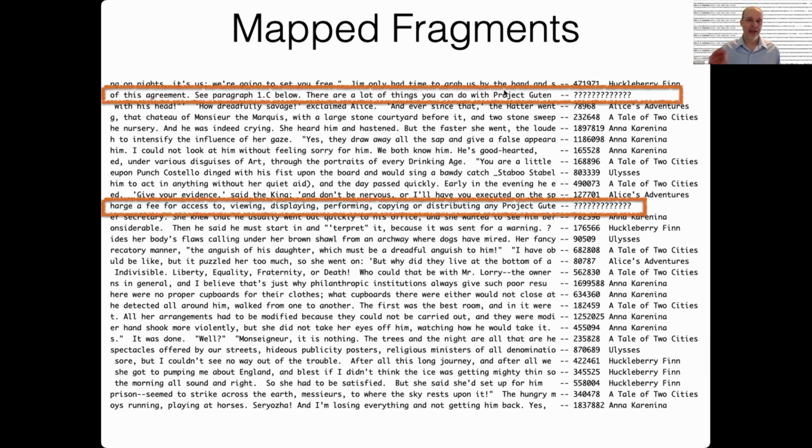So even though we're going to throw these out for the next steps, it is useful to look at them and say, here's something that I didn't expect. Why is it here? And how much attention do I need to pay to it? So I know where these came from. Again, we're going to throw them out for the next steps, but I know why this sort of unexpected result came about.